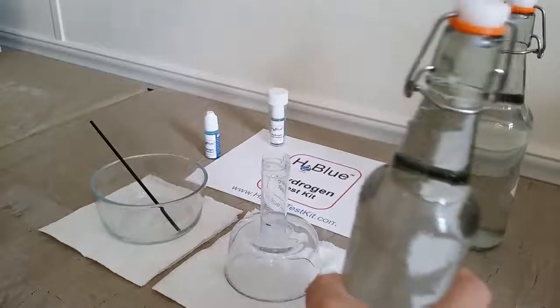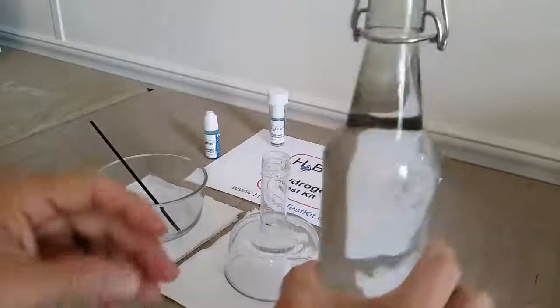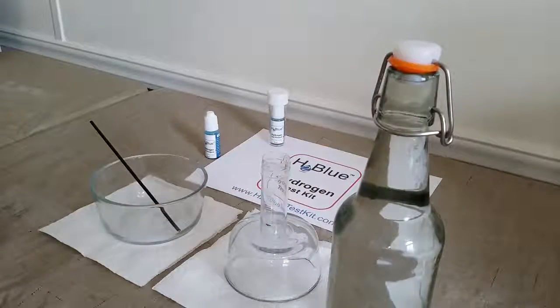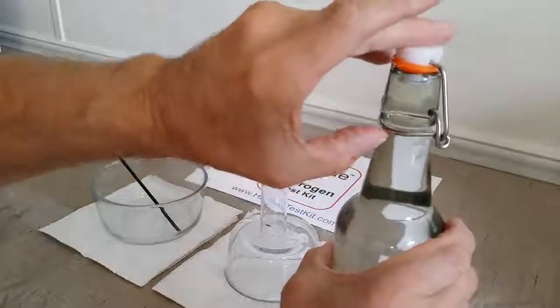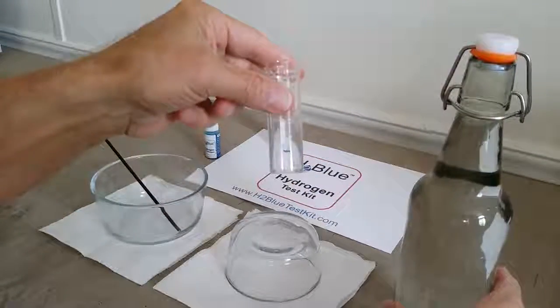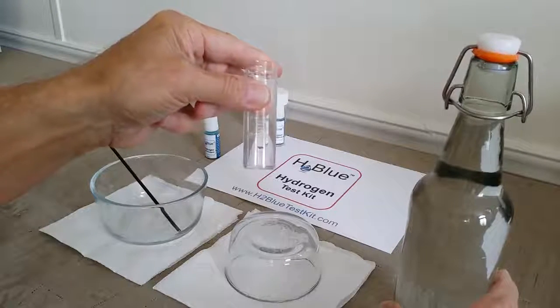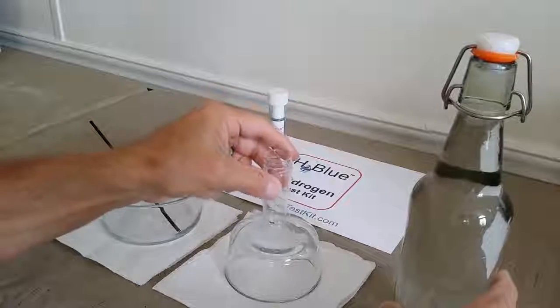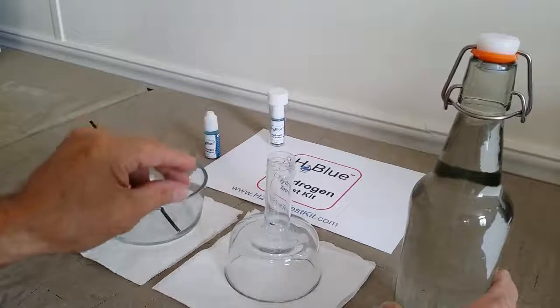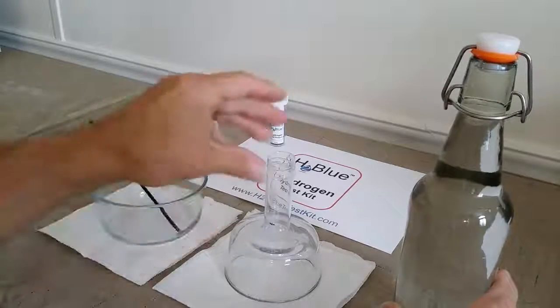In advance of this test, about 25 minutes ago, I dropped the tablet into this bottle. So now it's under pressure and ready to go. And when I open it, you'll hear a pop. And then what we're going to do is we're going to pour 6 milliliters into this graduated beaker that comes with the H2Blue. I've placed a black mark there so it makes it a little easier to see. Remember, we want to pour the level until the bottom of the curvature of the water, or the meniscus, is at the top of that mark.